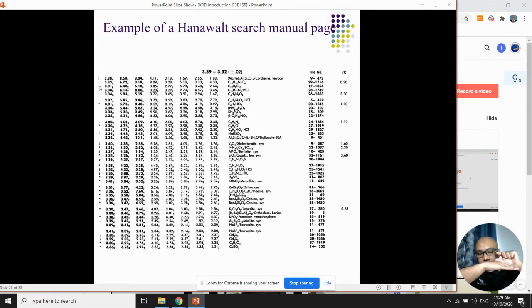This stacking of layers of planes containing atoms has a distance value. They have different orientations and different distances, so when you measure the distance, they give you some values, the value between the planes. How to read it, I will explain later.